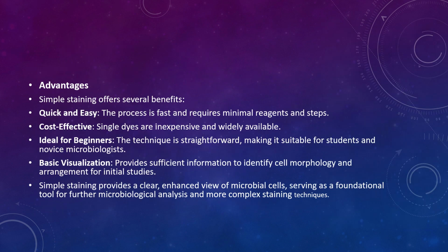Okay. And then advantages, a simple stain offers several benefits. Firstly, it is quick and easy. It's very quick because you apply only one stain. Within a few minutes, it's going to be prepared and you can observe it very fast. Okay, and minimal steps are present, minimal reagents are required here. That's one advantage. And secondly, it is cost effective. Okay, only one dye you are using here, which is not so expensive, and it is effective.